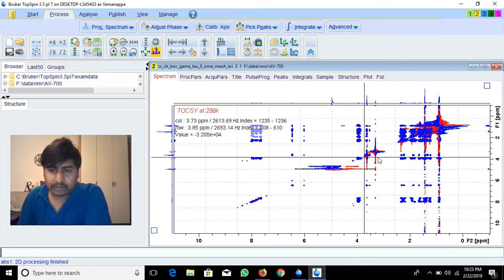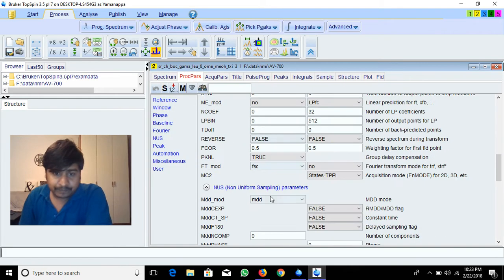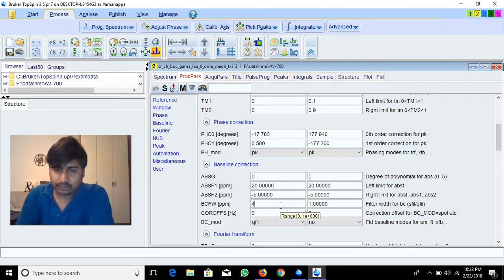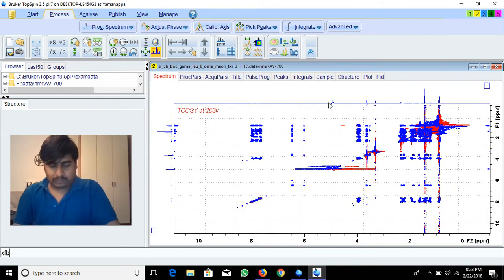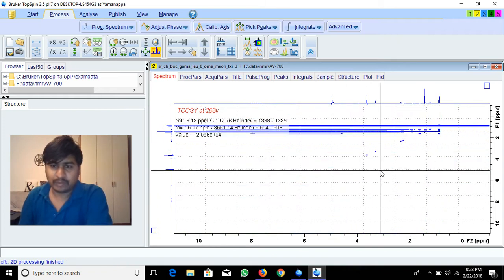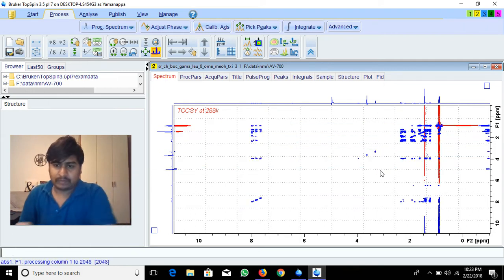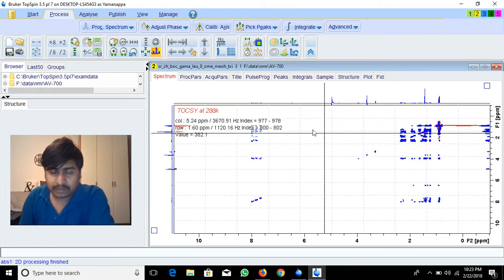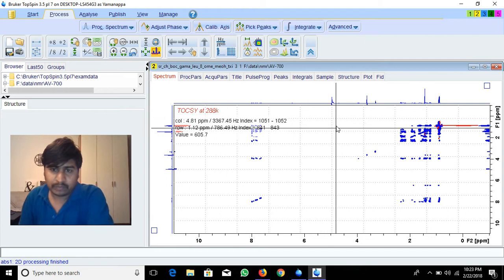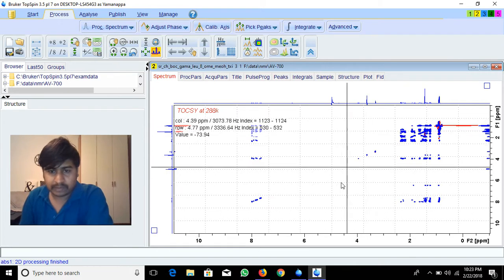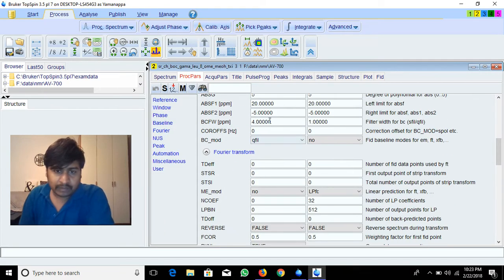If you increase the width more, it will suppress more. For example, I'll try giving 4 ppm — see what happens. With 4 ppm it suppresses completely — all cross peaks are gone too, the intensity is completely removed. A 4 ppm width means 2 ppm on the left and 2 ppm on the right are suppressed. So when using qfill you must be very careful about how much ppm you suppress.